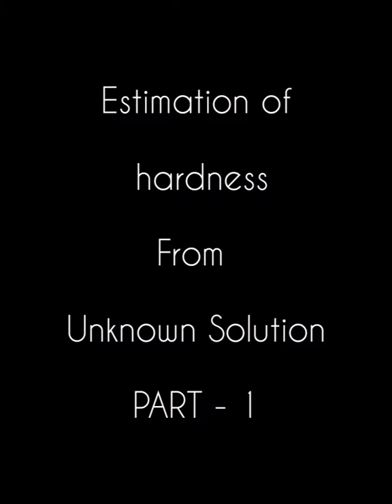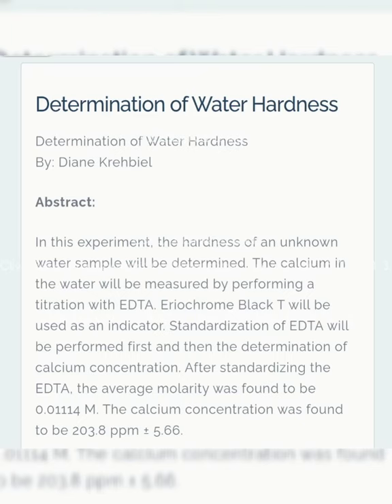Estimation of hardness from unknown solution, part one. Determination of water hardness. In this experiment, the hardness of an unknown water sample will be determined. The calcium in the water will be measured by performing a titration with EDTA. Eriochrome Black T will be used as an indicator.